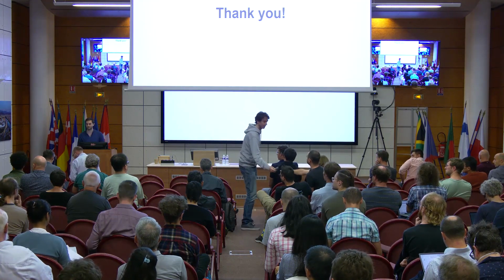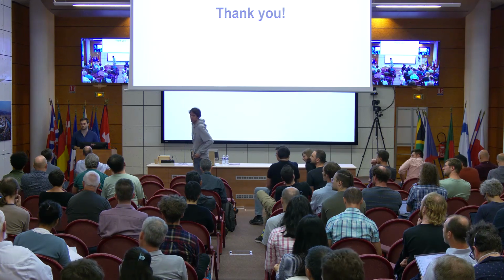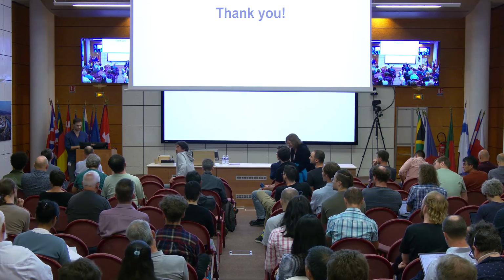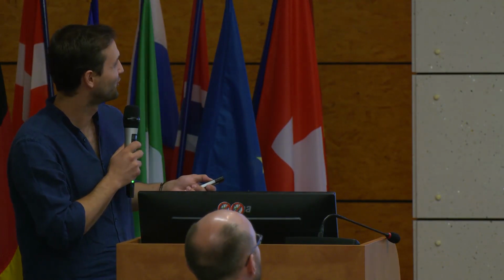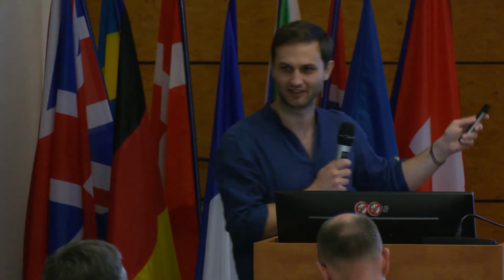Your task list was very interesting. Have you thought about making that sort of mandatory for some things? So, for example, if you're setting up a user, you want to check the energy, you want to set a calibration, there's a set-defined list of tasks that someone must do. So this whole view, it's customizable. So you could also have other widgets. That's just a complementary comment.